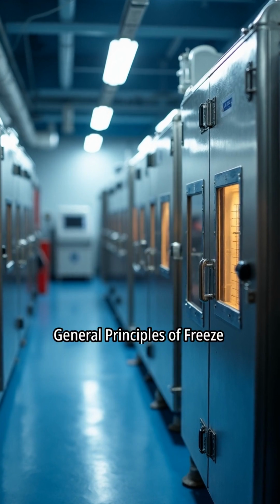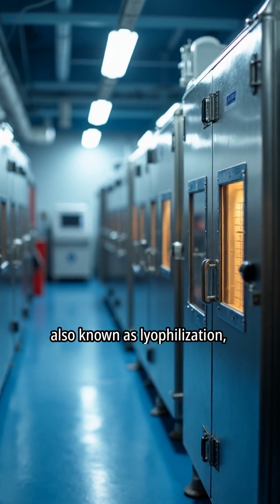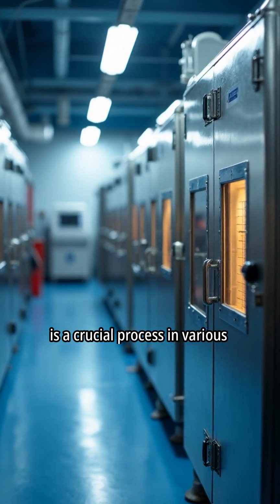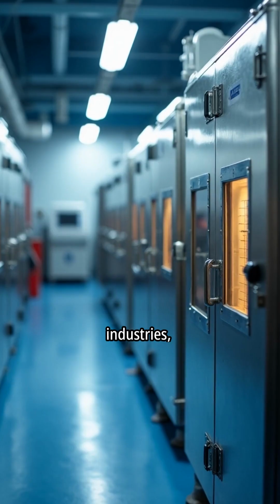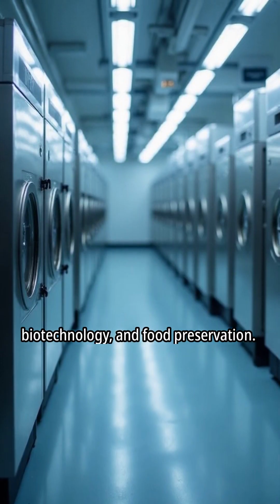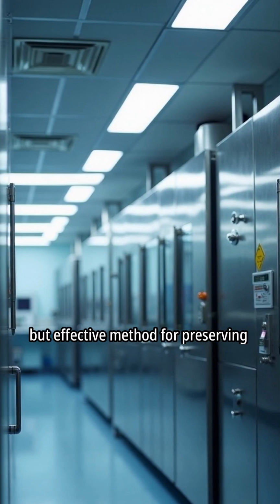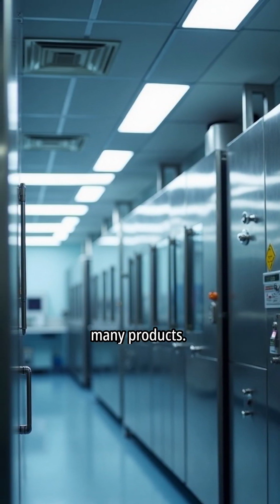General principles of freeze drying, the lyophilization process. The principle of freeze drying, also known as lyophilization, is a crucial process in various industries, particularly in pharmaceuticals, biotechnology, and food preservation. Important points. Lyophilization, freeze drying, is a complex but effective method for preserving many products.